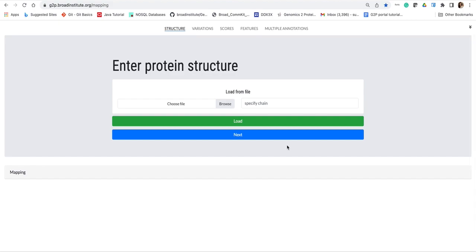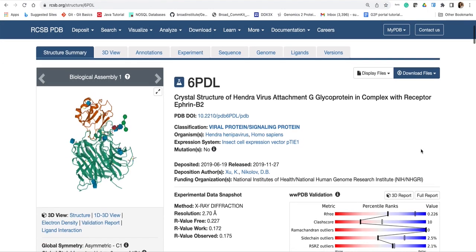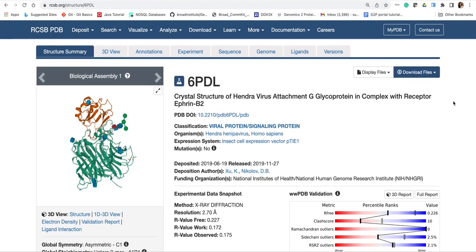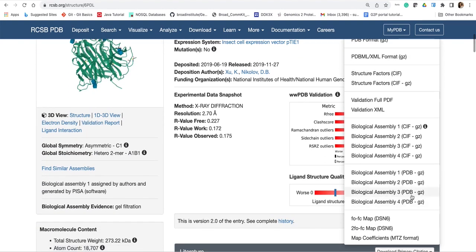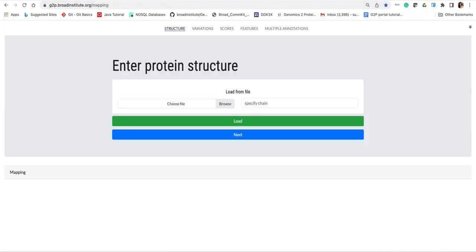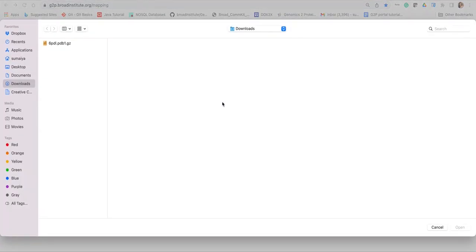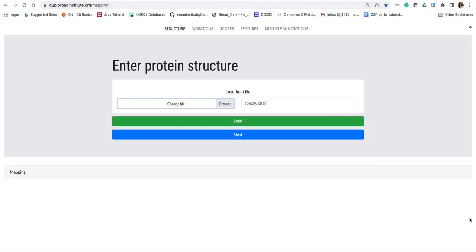We will click on this button and we will need to upload the structure by browsing it. For that, we will first go to the PDB database and download our structure. I will download the first biological assembly and upload the structure onto the portal.